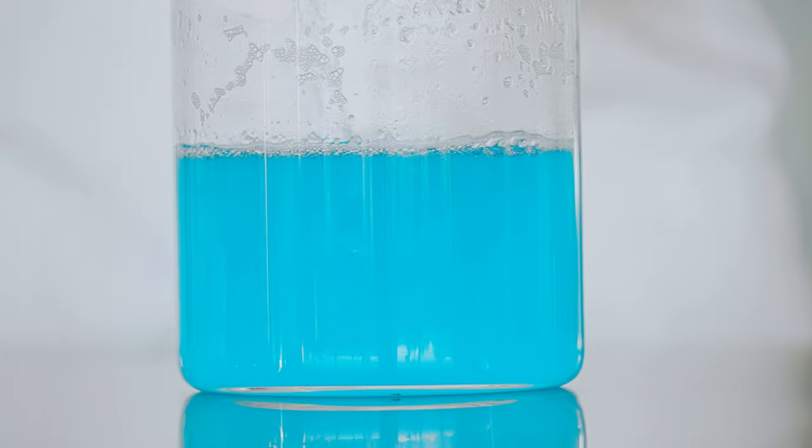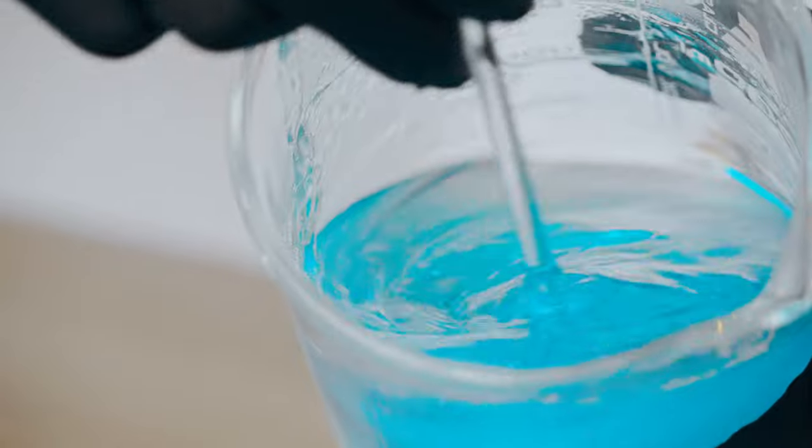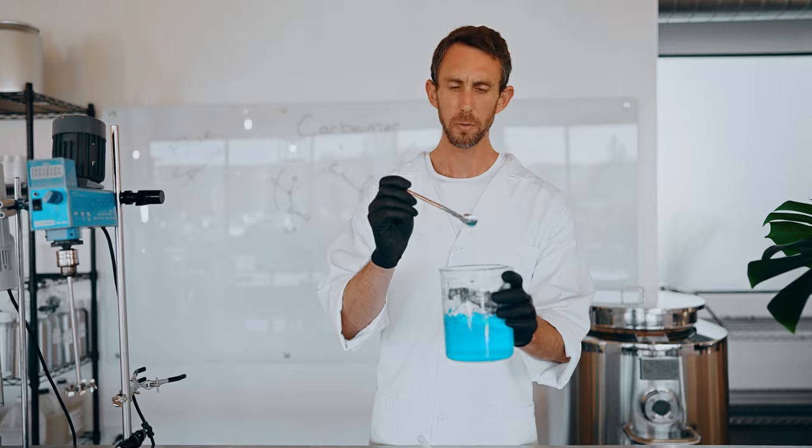We've got the beautiful gel formed. The carbomer is dispersed. You can see it's nice and thick. Look at that beautiful gel.